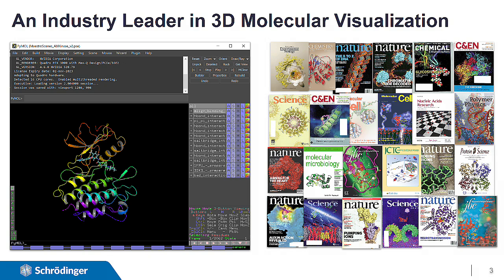PyMOL provides high-quality visual representations of molecular structures, allowing researchers to analyze and interpret complex biological data. And it offers a basic range of features and functionalities for building, measuring, and analysis, though it does lack the sophistication for high-end simulations, predictions, and other in-depth analysis that our other tools like Maestro offers with the Schrödinger suite of applications, but more on that later.